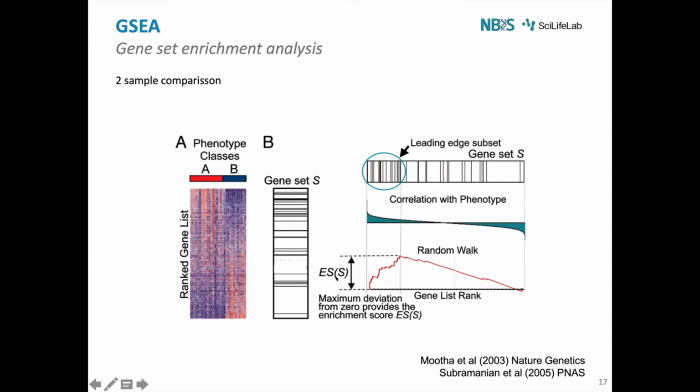As you move forward, that increases the amount of enrichment terms that you have, and then the rest of the path will eventually go down to 0. But since you don't have that many, they will go down slowly. And in that case, this is how we consider an enriched term, because now we don't need to filter by p-value, by fold change or anything. We just have to sort the genes based on their abundance when you compare those 2 groups.